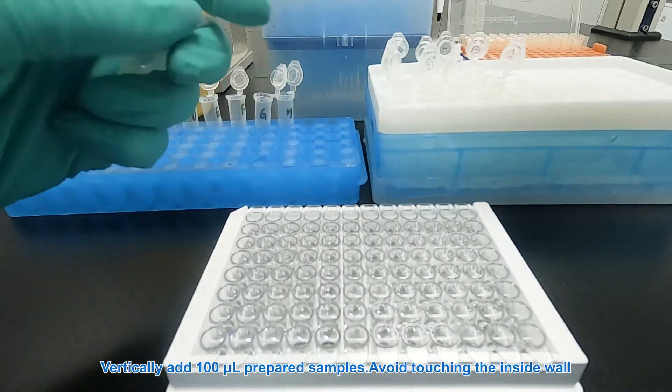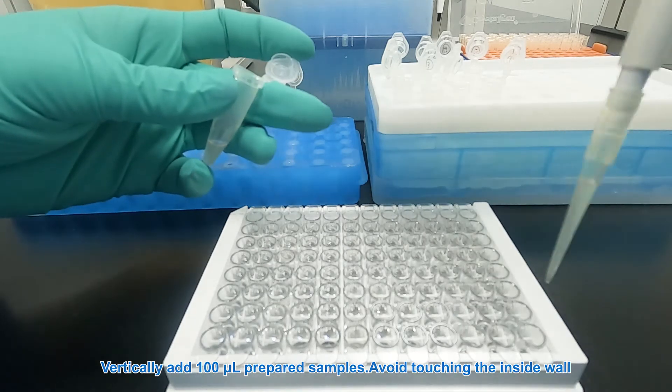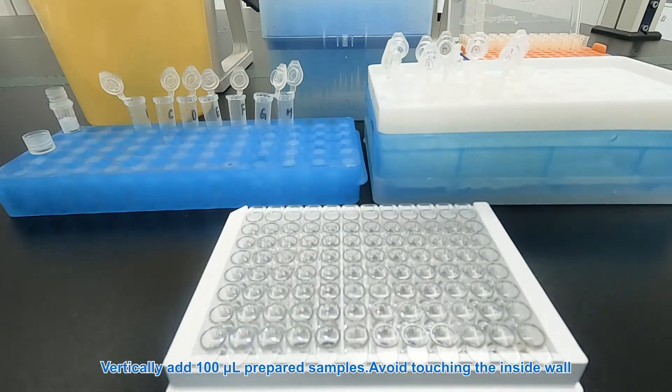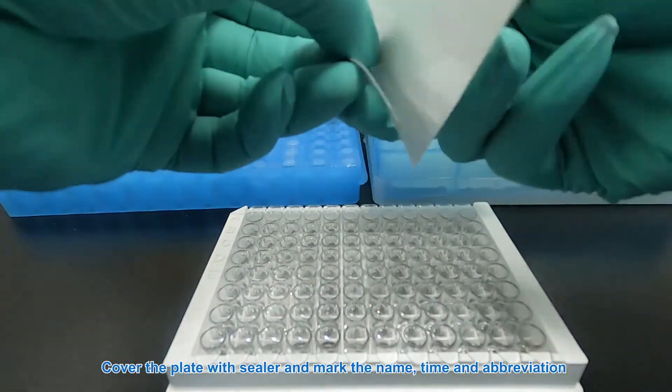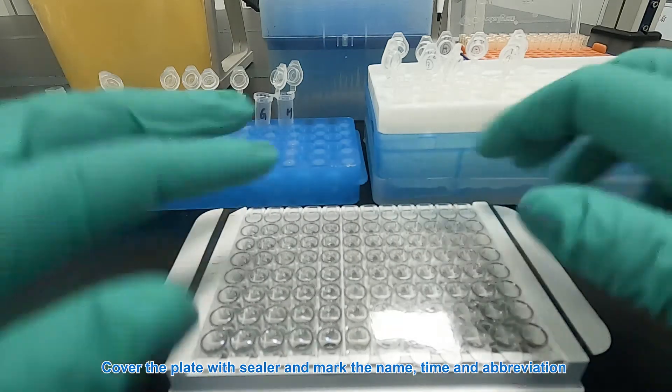Vertically add 100 microliters prepared samples, avoid touching the inside wall. Cover the plate with sealer and mark the name, time and abbreviation.